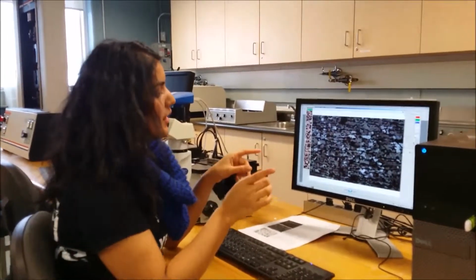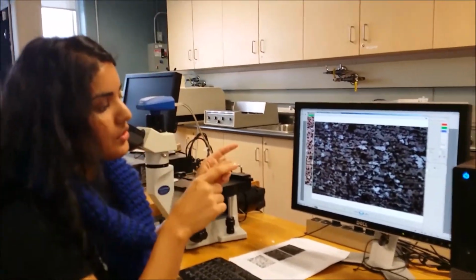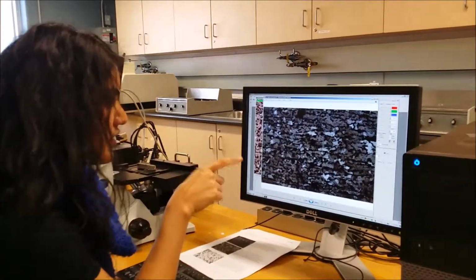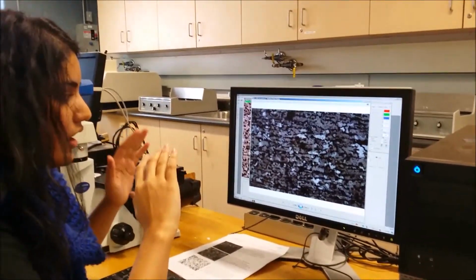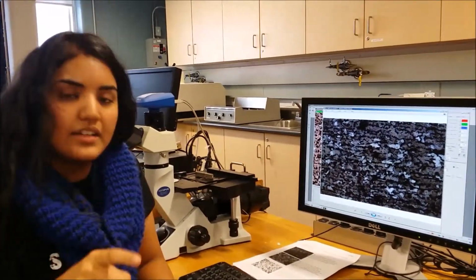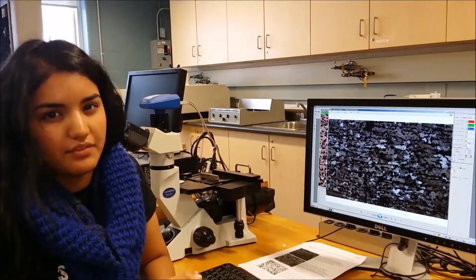So this is the left side. We start from the high carbon, so we're moving on to the heat affected zone. So you can see the grain sizes are still large and it is still loosely packed. But even though it is heat affected, its hardness is still soft.